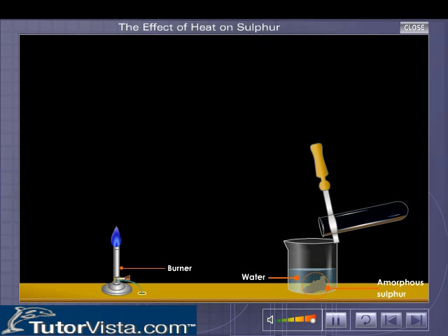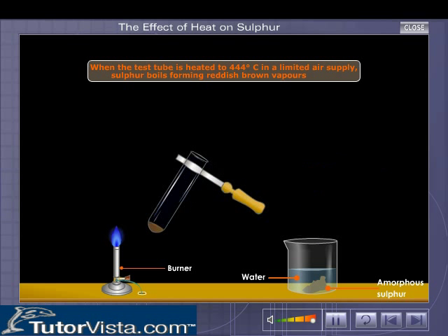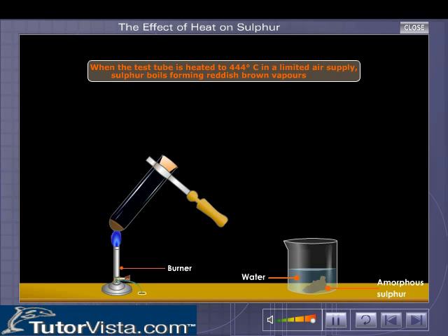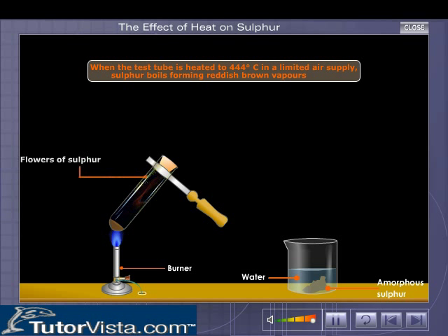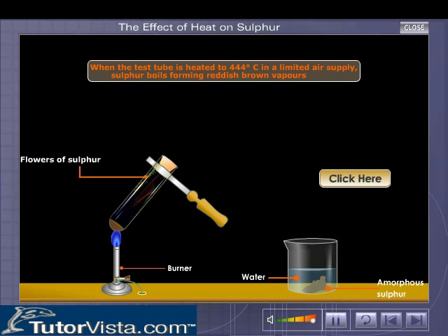When the test tube is heated to 444 degrees Celsius in a limited air supply, sulfur boils forming reddish-brown vapors. The vapors of sulfur condense on the cooler parts of the test tube to form pale yellow powder, commonly called flowers of sulfur. Click here to learn why these changes take place.